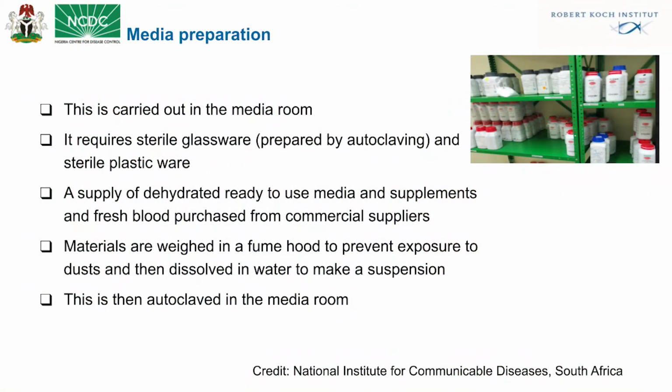Media preparation. Media preparation in a medical microbiology laboratory is carried out in a media room separated from the main laboratory. It requires sterile glassware prepared by autoclaving and sterile plasticware. A supply of dehydrated, ready-to-use media and supplements, and fresh blood is purchased from commercial suppliers. Materials are weighed in a fume hood to prevent exposure to dust and then dissolved in water to make a suspension. This is then autoclaved in the media room.